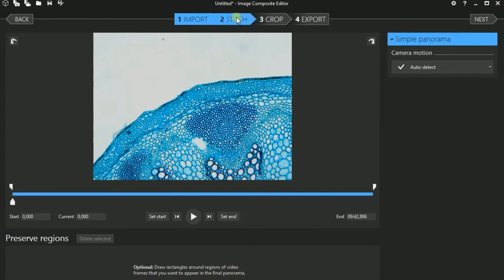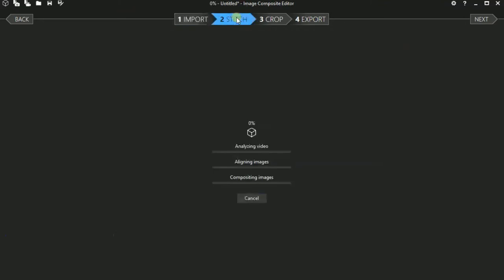I click Stitch. And now you have to be patient because this is a large picture and there are many images here. This took maybe a half an hour, 45 minutes. So of course I'm going to fast-forward now. This is really a very time-intensive process.